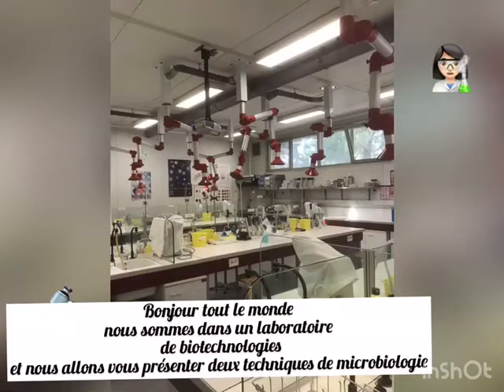Hello everybody, we are in a biotechnology lab and we want to present you two microbiological techniques: how to prepare a bacterial suspension and the Gram staining procedure.